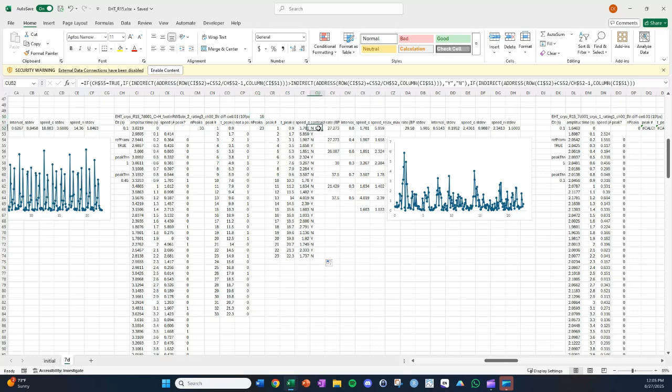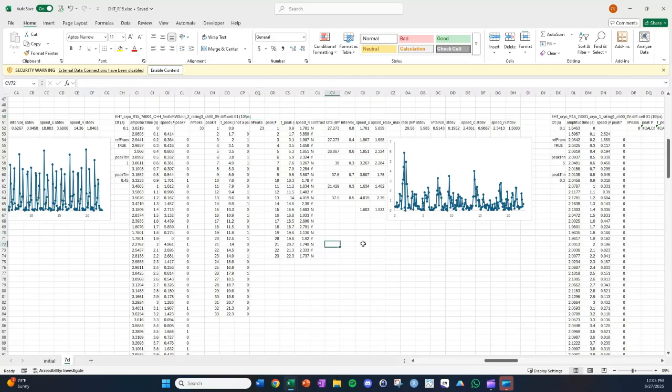When parsing through this, we got 11.5 beats. Within a reasonable range, I think. And there's, of course, some subjectivity here as to where you want to place the cutoff. Do you really want to analyze this sort of thing? I would say some of these are kind of borderline. I think anything below 2 arbitrary units per second, I would be suspicious of noise.